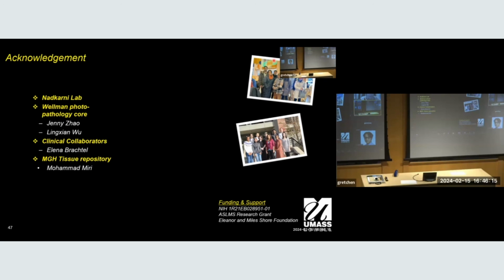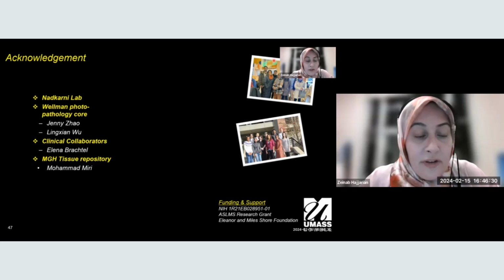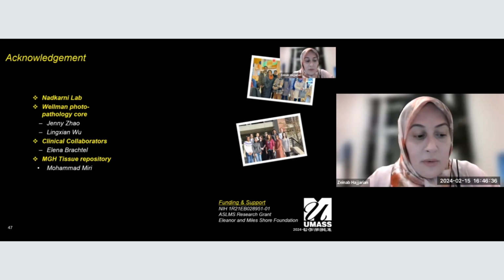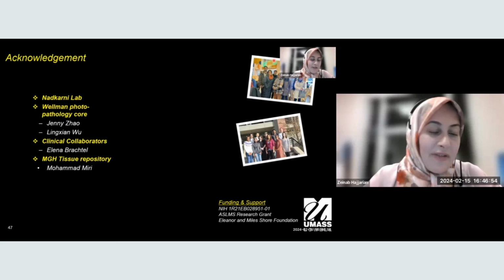And what was the frame rate for the camera? Oh, the frame rate depends. For this study, the frame rate was about 250 because we were just probing up to 40 hertz. But if you want to probe mechanical properties at higher frequencies and look into differences in viscosity and elasticity, our colleagues have been using frame rates up to a few 100 kilohertz. Okay. A camera at 1 million frames per second would be ideal, but then you would need a brighter laser.